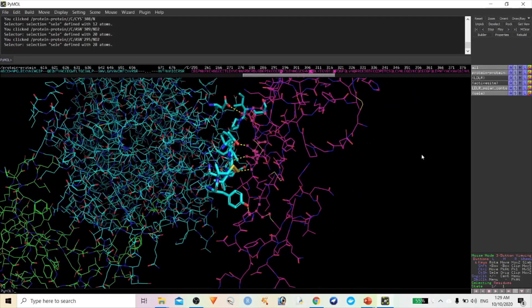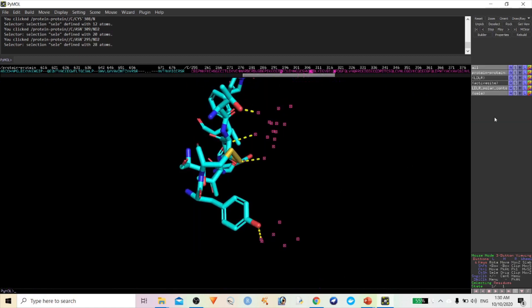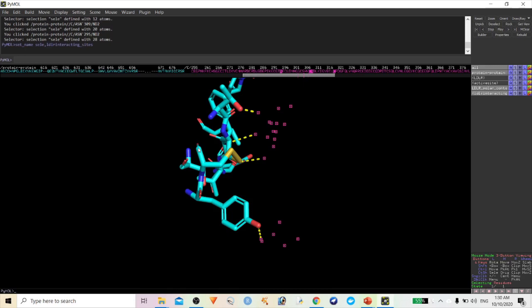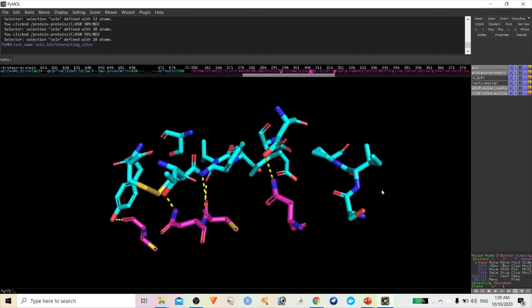Now hide the cartoon, hide the lines, and again show the sticks for the LDLR interacting sites. Show sticks for the interacting sites. This is how we can use PyMOL to identify protein-ligand, protein-protein, and protein-metal ion interactions.